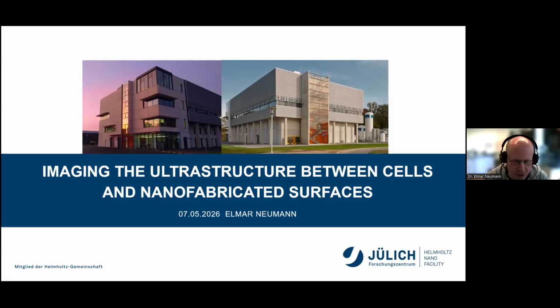Okay, thank you very much for the introduction. And also, good afternoon to everyone here. I'm going to start with how to image the ultrastructure between cells and nanofabricated surfaces with the help, mainly, of SEM and electrons. The location where I am now is the Helmholtz Nano facility. This is a clean room where most of the ultrastructures are fabricated before cells grow on them. And we also need to do this in order to investigate the success of these.